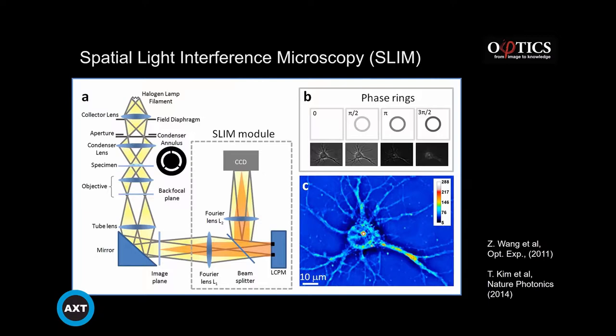These images have in common the same incoherent background, but different coherent contributions. So subtracting the two pairs of images from each other, we only select the coherent component and subtract out the multiple scattering contribution. The end result is a uniquely defined phase image where the intensity in every pixel is the optical path length change of the sample, as illustrated by this image here.